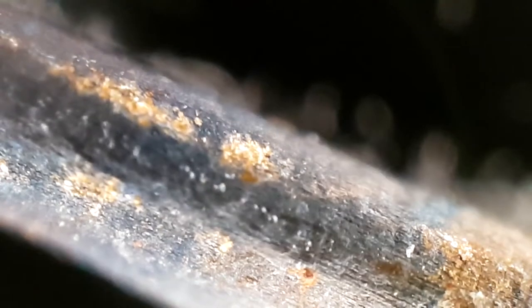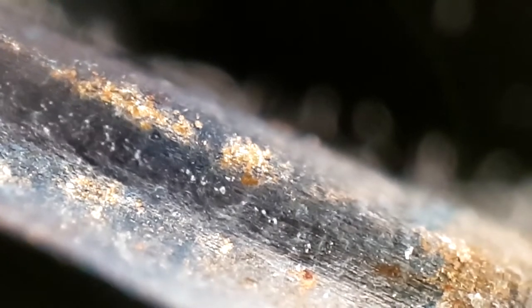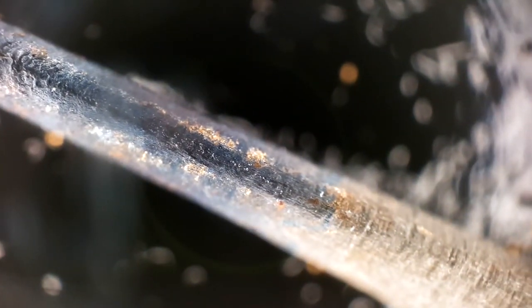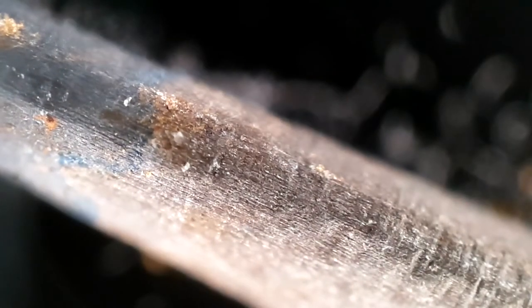People can do screen grabs and shift focus, focusing. It's gone from a kind of blue tinge on the tungsten there to a kind of more browny tinge here in the colour.